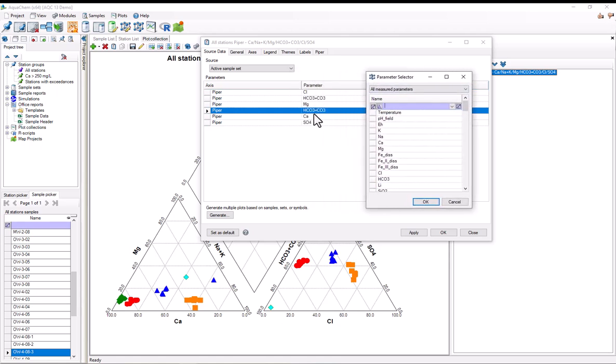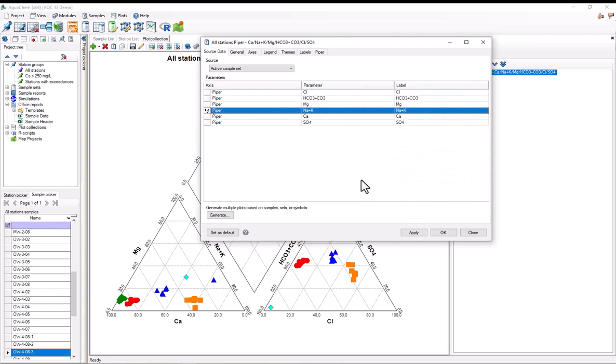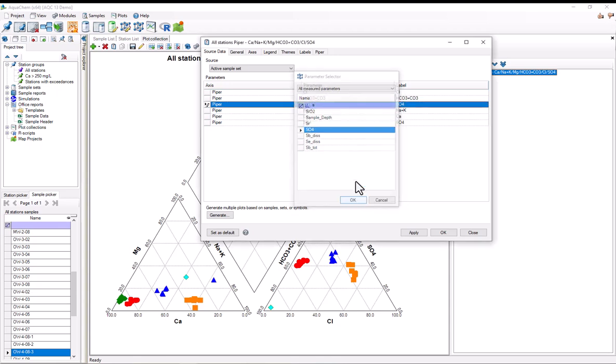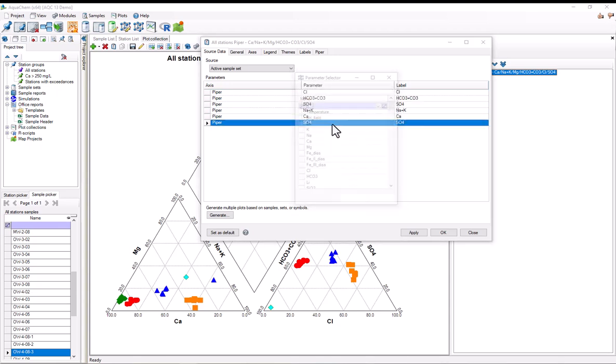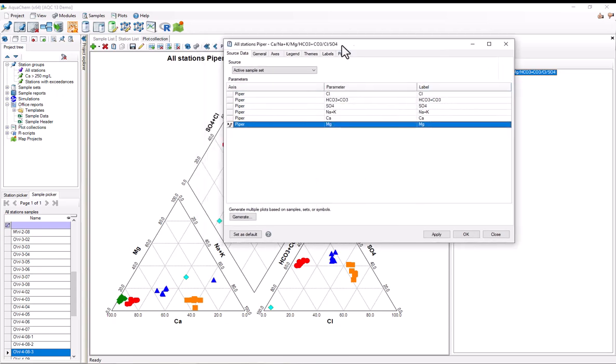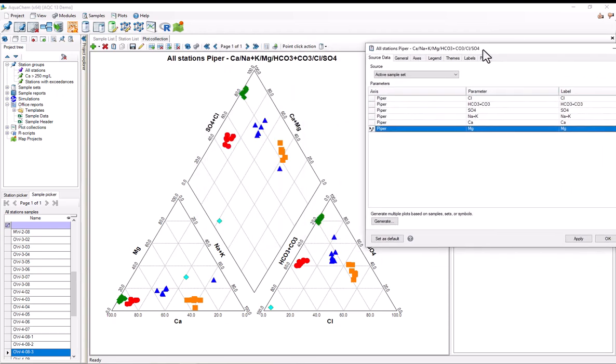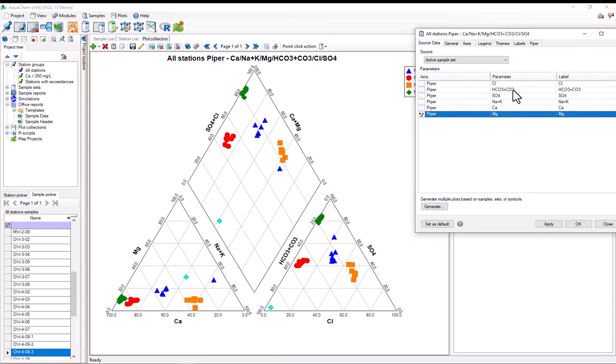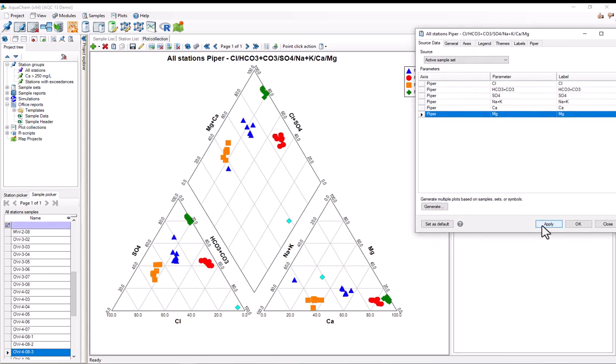I'll select bicarbonate plus carbonate, and in the parameter selector, I'll select sodium, hold down ctrl-click, and then select potassium, hit OK. Now I'll just quickly switch the other parameters here, so this magnesium to sulfate, and vice versa, and now when I hit apply, we should see the axis switch, and there you go.